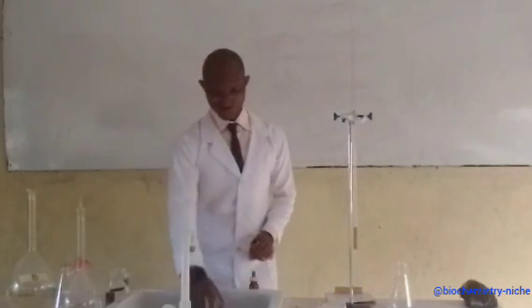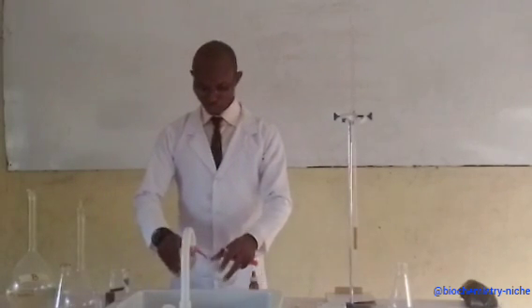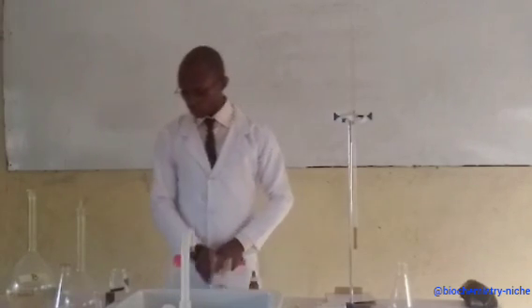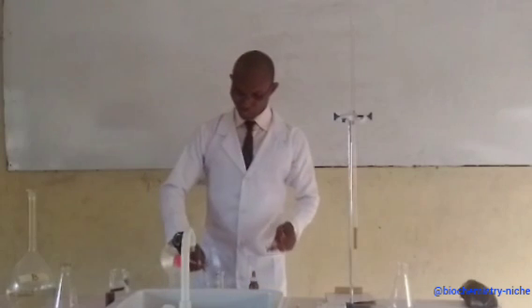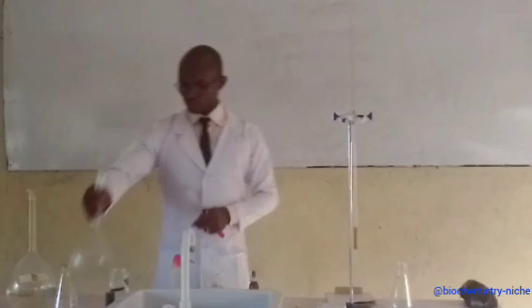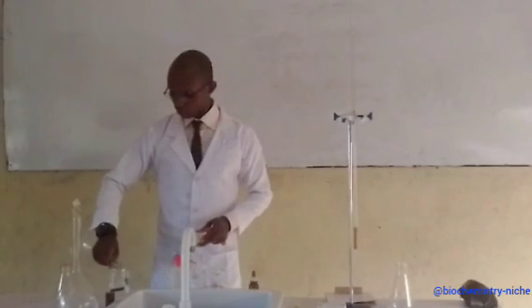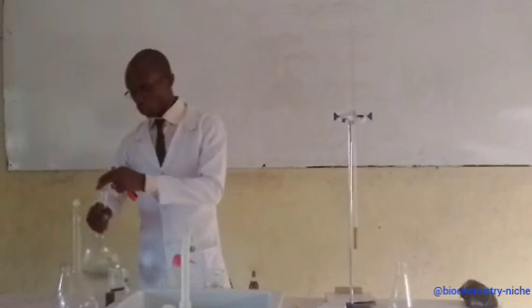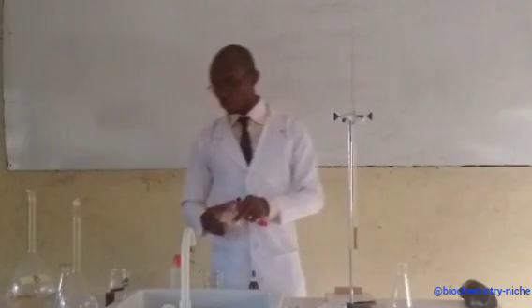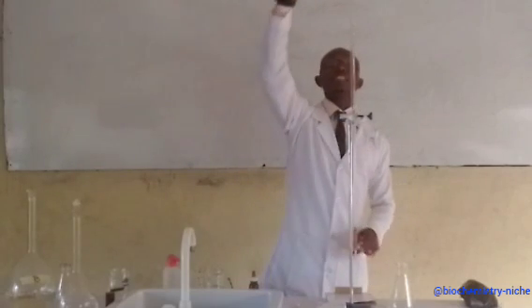Now, we quickly want to do this. So let us start from there. Okay, let me rinse this to avoid all types of impurities. Okay, so I am putting here my A. I have my A here. And here I have my B. So try as much as possible to be careful when carrying out your practical. So this is my funnel which has been rinsed, but let me rinse again. So make sure your funnel is very, very clean.